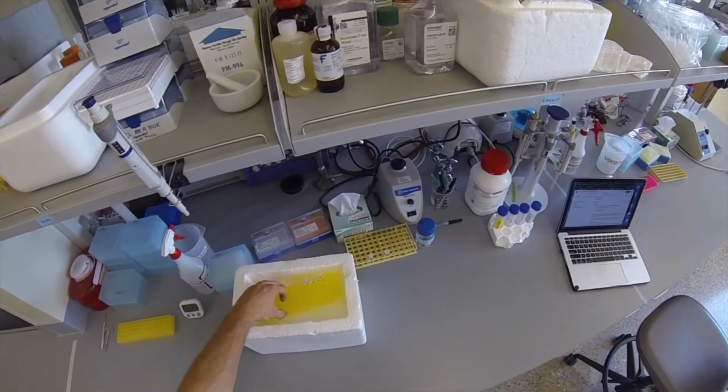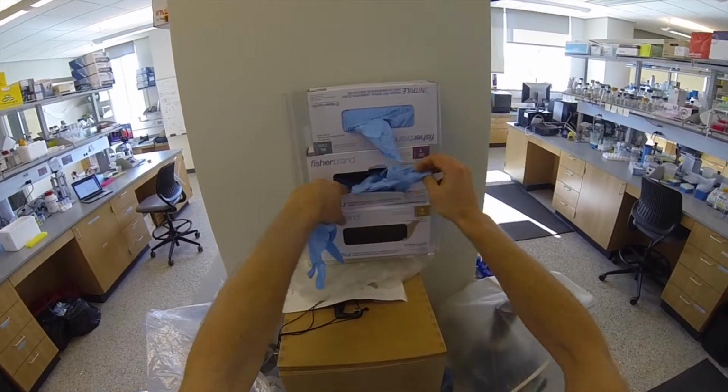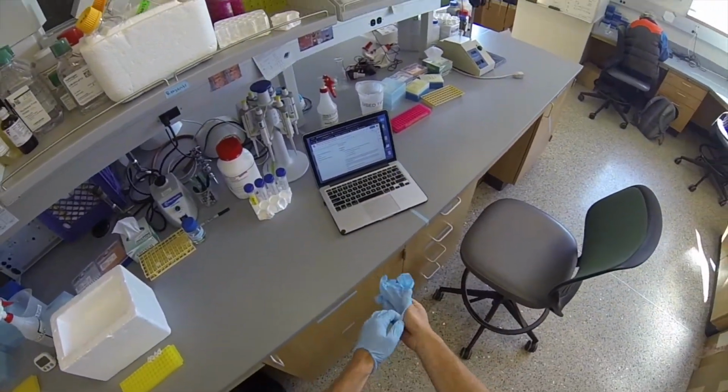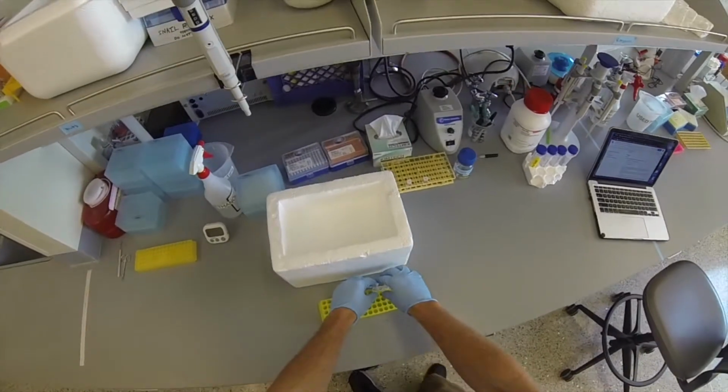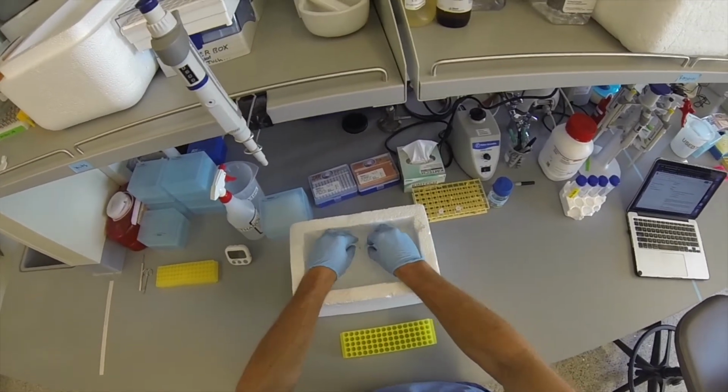Before handling any samples, remember to always have gloves on. Make sure all samples are directly on ice.